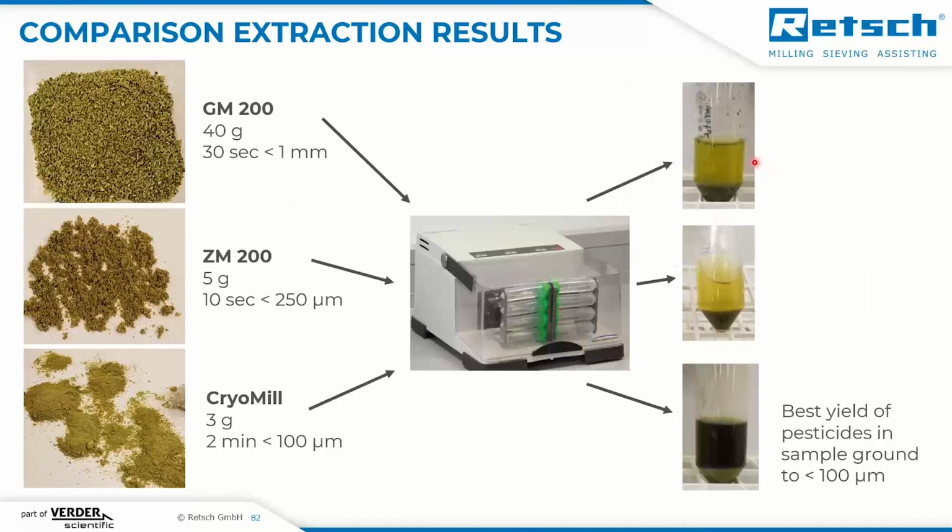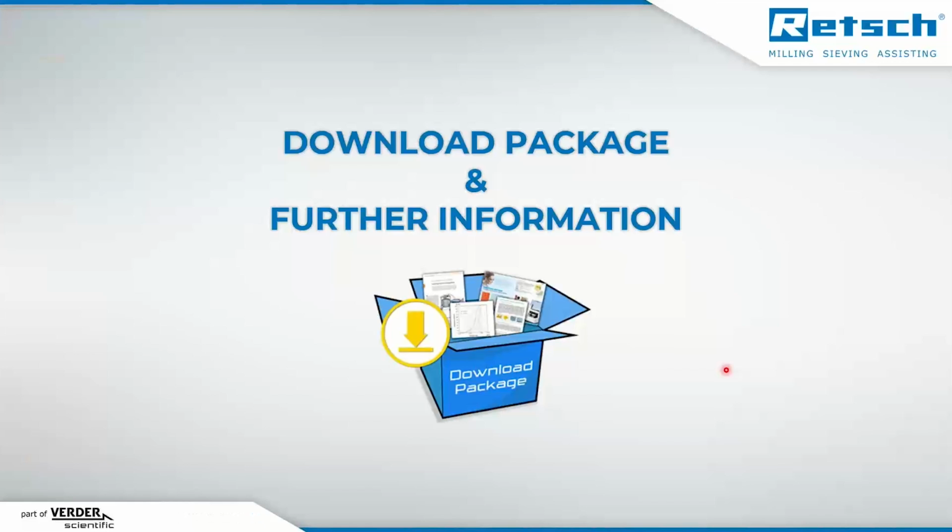We see that the best yield is with the finely ground sample from the CryoMill. So indeed the grinding factor, or the particle size, influences the extraction and can help to come to better results. Now I'm at the end of the presentation.